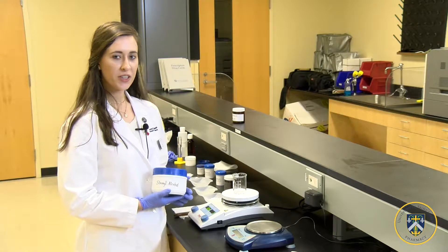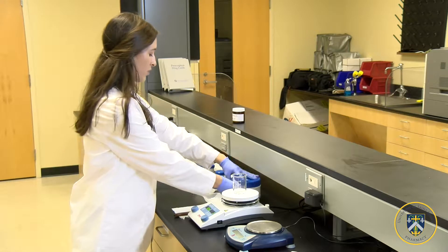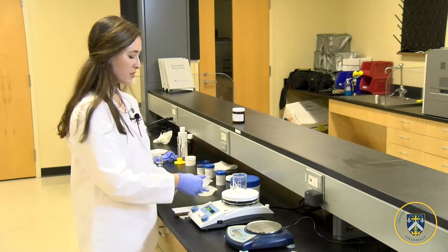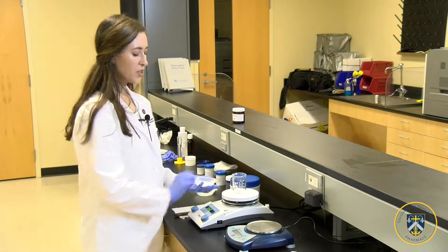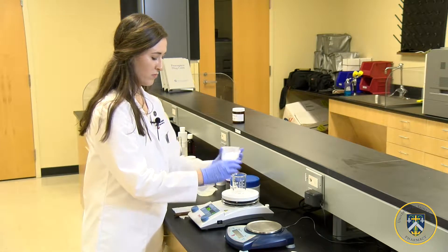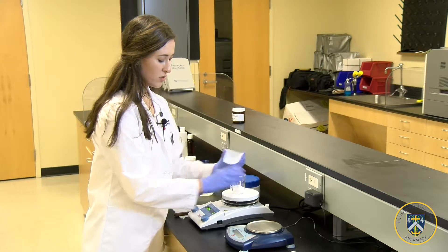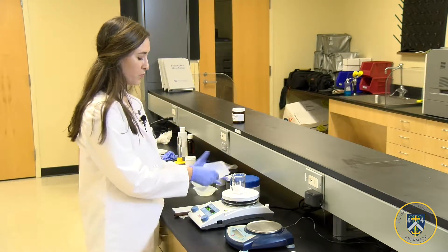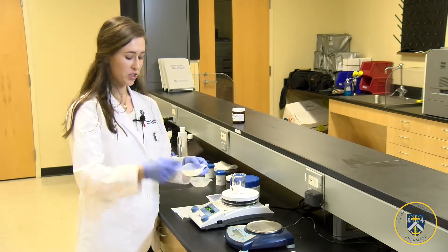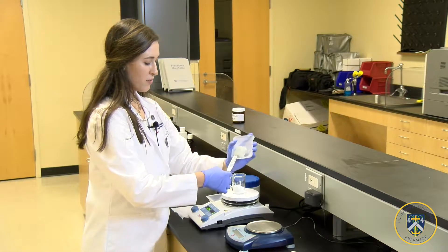The first step to creating hydrophilic ointment is to add our emulsifier stearyl alcohol along with our white petrolatum in their necessary amounts into a 100 ml beaker on a hot plate. We add the stearyl alcohol first so it covers the bottom of the beaker, which allows it to melt, and then using a spatula we'll scoop out the necessary amount of white petrolatum.